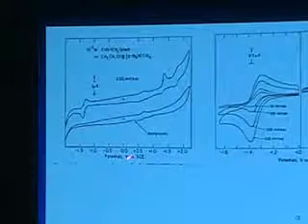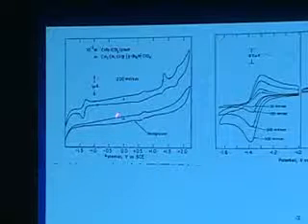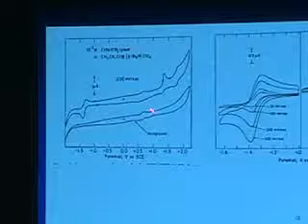First item to point out, there's the baseline. That is the acetonitrile TBAP platinum electrode system. And you'll notice there's a little bit of gunk in here. There's some waves right there, and you can see them right there in the cyclic voltammogram of interest. So if you did not have this baseline, you might say, I'm going to interpret these waves in terms of having something to do with the chlororhenium tricarbonyl complex. So that's why you want to do a baseline.